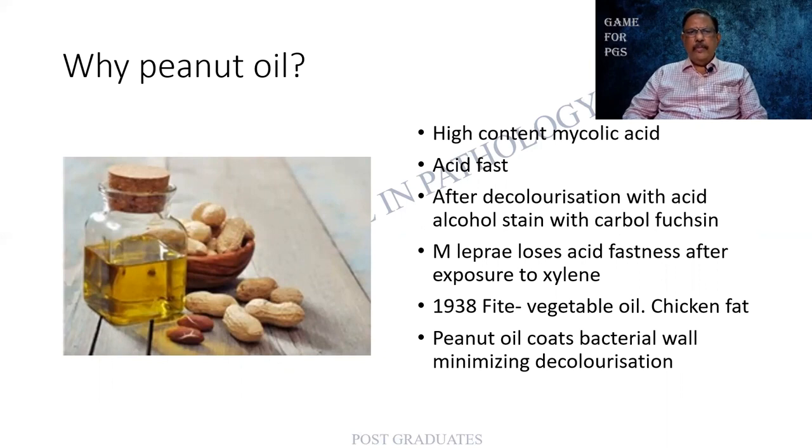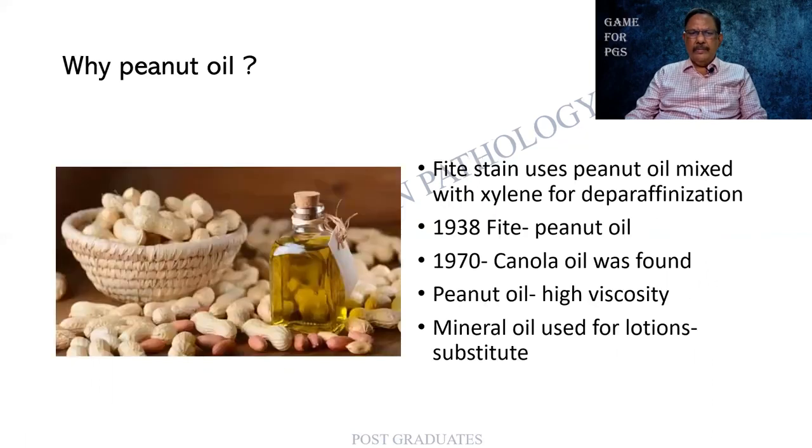So you are likely to be asked this question. Why are you using the peanut oil? So this much explanation you people should give. It should be to preserve the bacterial wall with the mycolic acid.